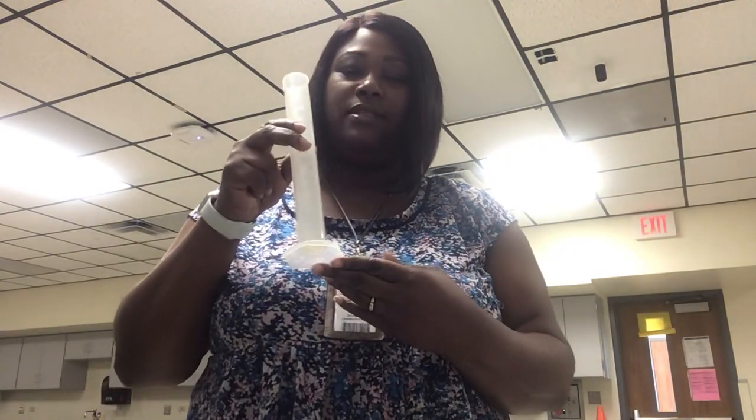Hello class, I'm going to teach you how to calculate density using the water displacement method. First of all, you're going to need a graduated cylinder. You're also going to need a triple beam balance.